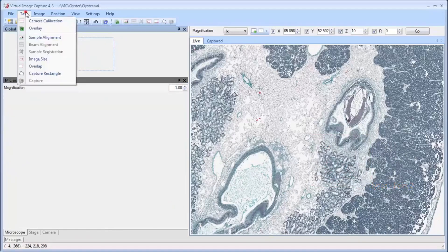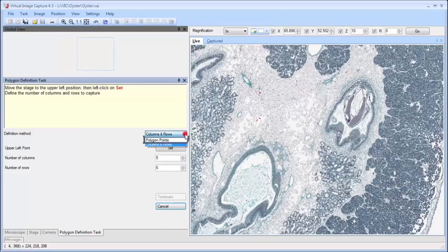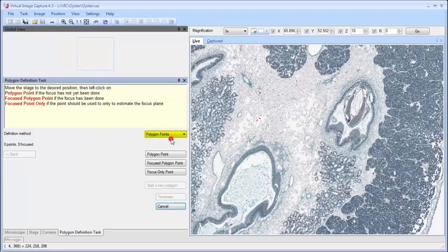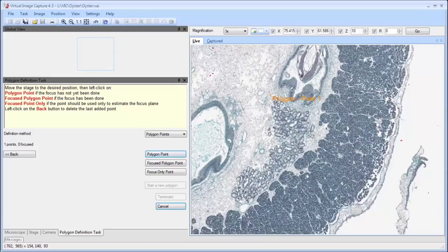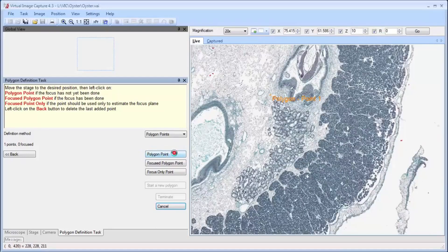The same region can also be defined based upon a polygon-shaped definition method. The location of the center of the current field is used when adding points. Defining two points is enough when the triangulation focus method is not used.